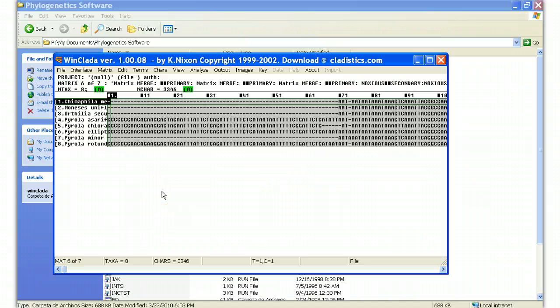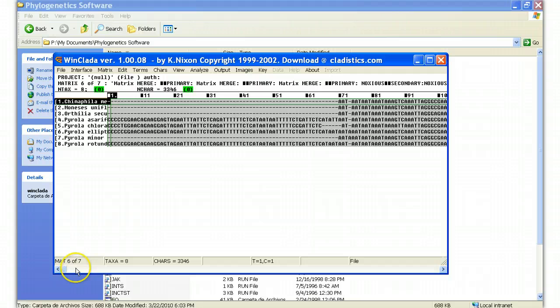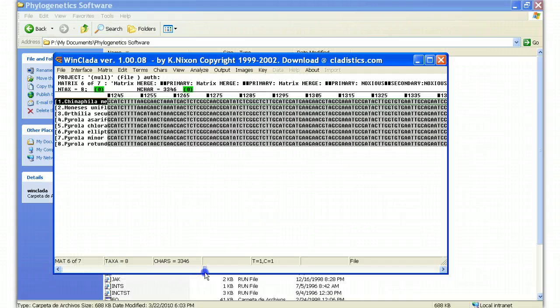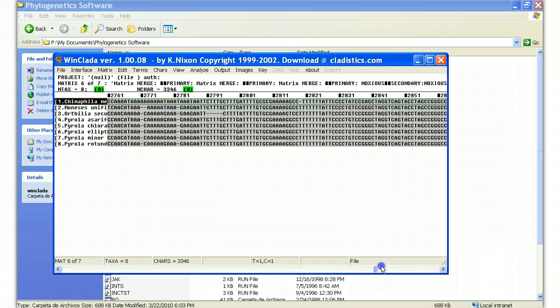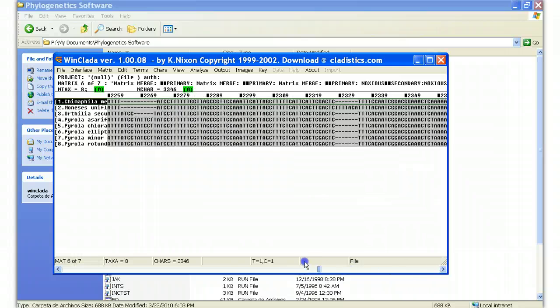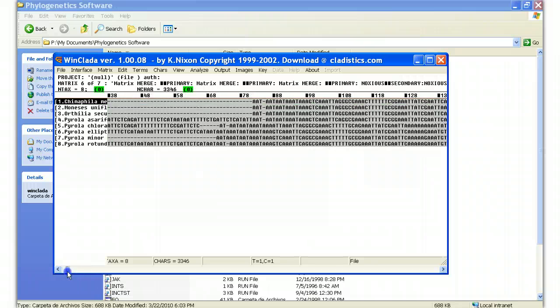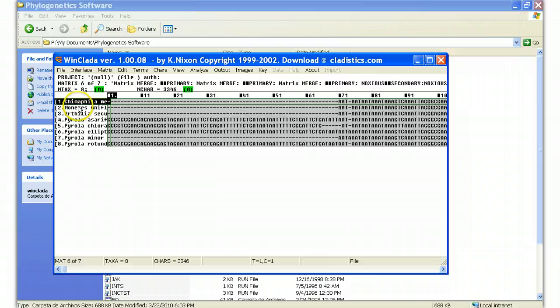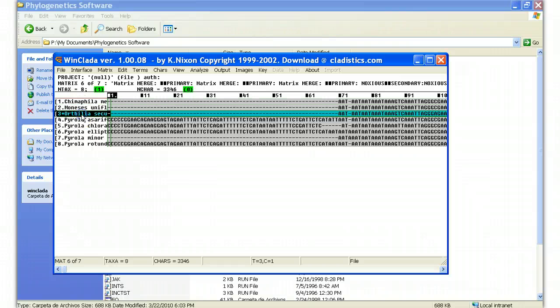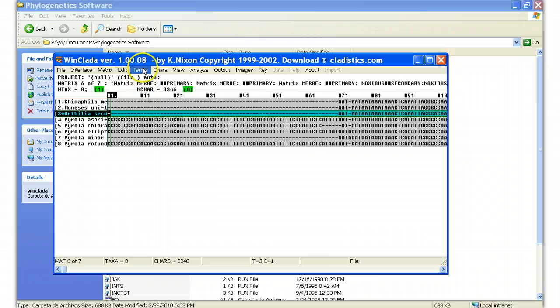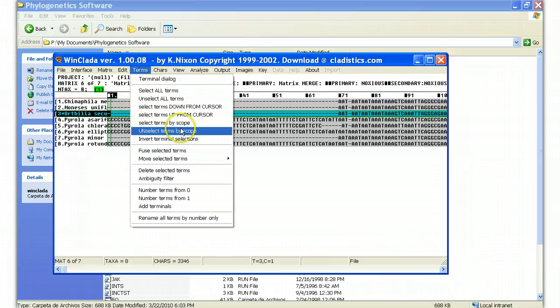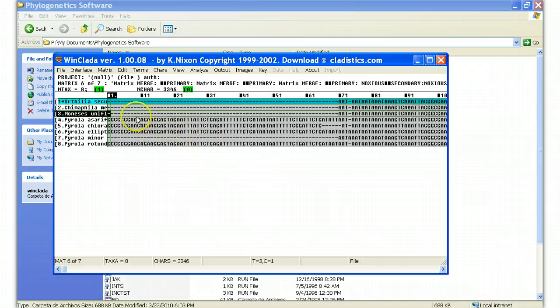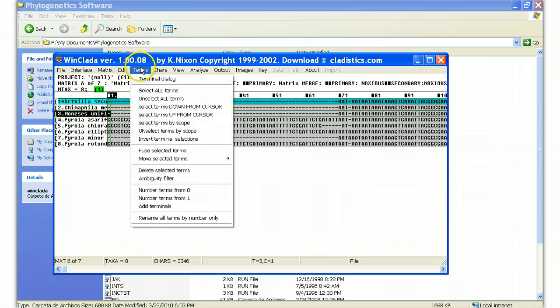So now what Jim has is this humongous file containing his eight taxa of interest, and it has 3,346 characters. If I go all along here, these are all DNA sequence characters that Jim can now use in an analysis. Then it's exactly what you did for your systematics project. One of the things I want to make sure of is that my outgroup, the outgroup that I want to use for my study, is the first taxon here. For example, if I wanted this taxon to be the first taxon, I double click on it so that it's highlighted in blue.